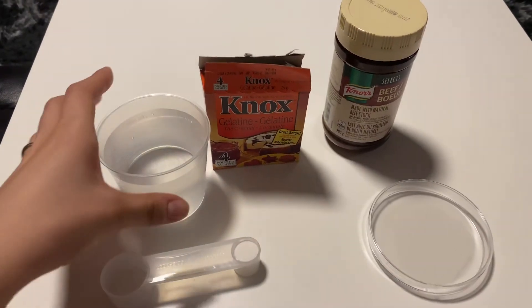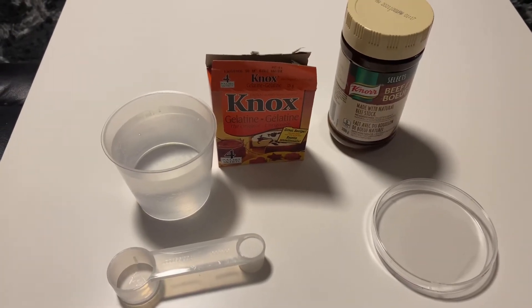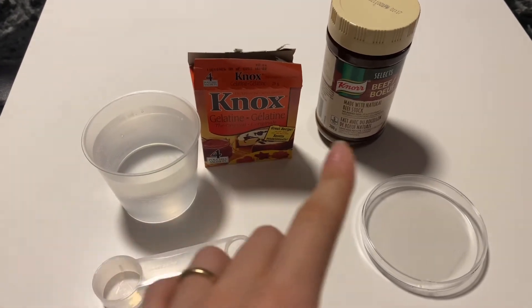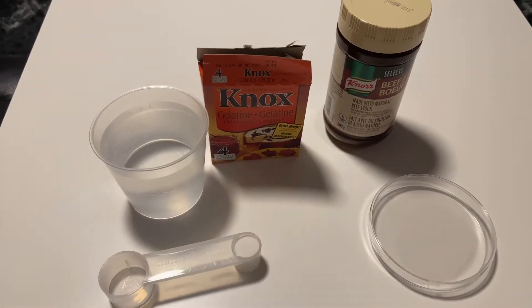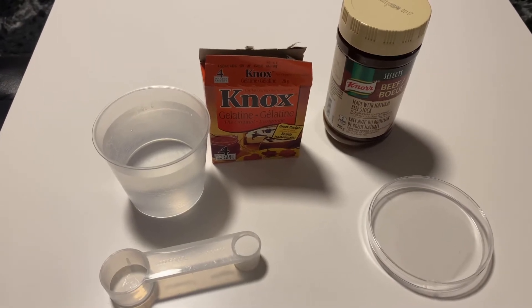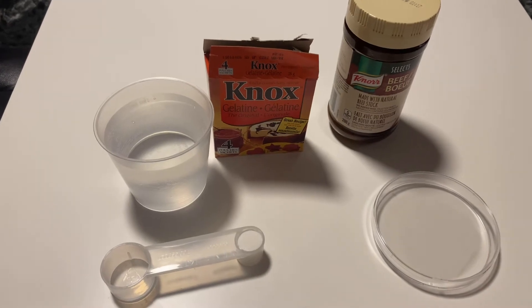Firstly, we take the water, we boil the water, and then after 2 minutes, after the water is already boiled, we add the sugar, the gelatine, the beef extract. Then we leave only 1 minute until everything is melted and then we fill the agar plates.